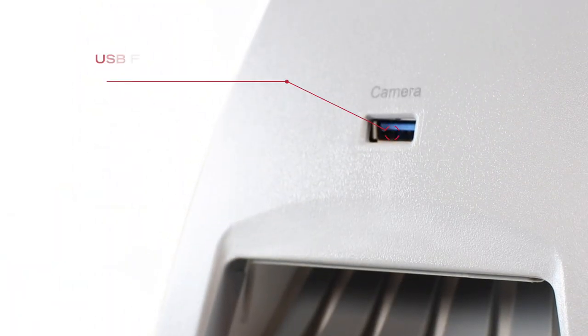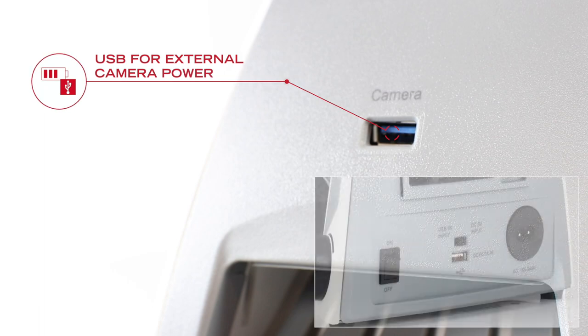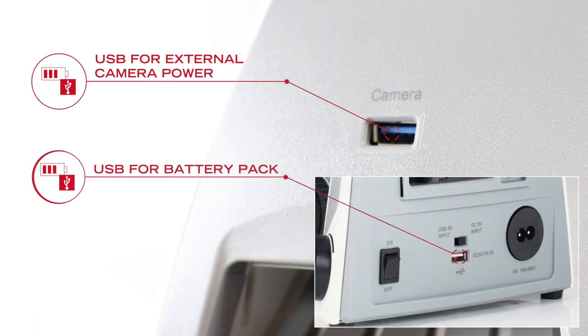Enlarge your options with an integrated USB port for camera or battery pack.